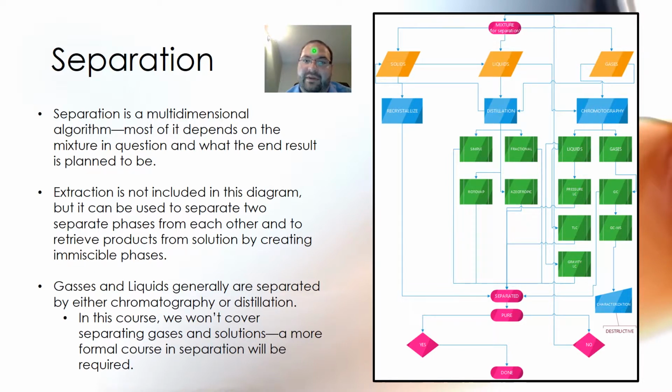And there are reactions where you can bubble gases through liquids and actually introduce chemical species into reactions. There are ways to do that and setups for it. And you have the glassware for it. But we just don't have any experiments where we do that. So the next thing is kind of what do you get into when you have liquids and gases?